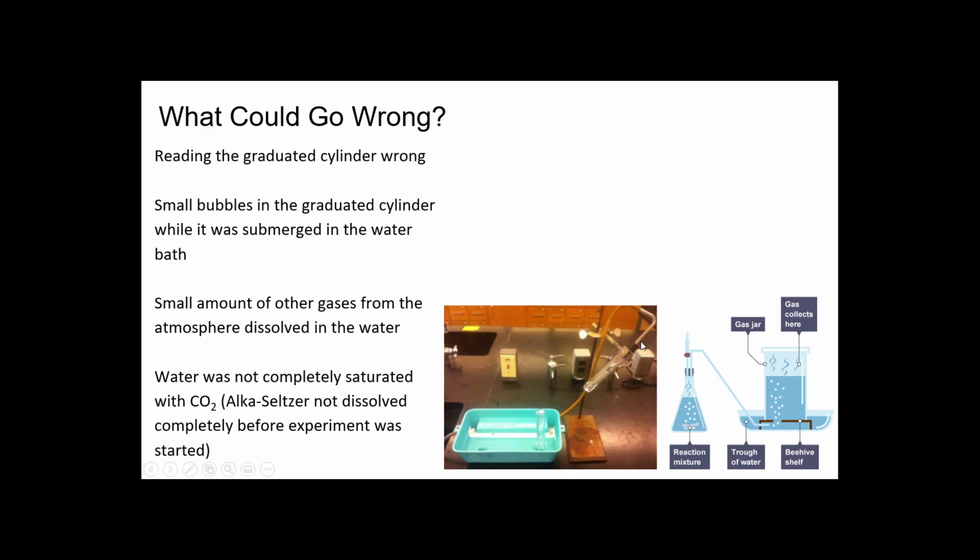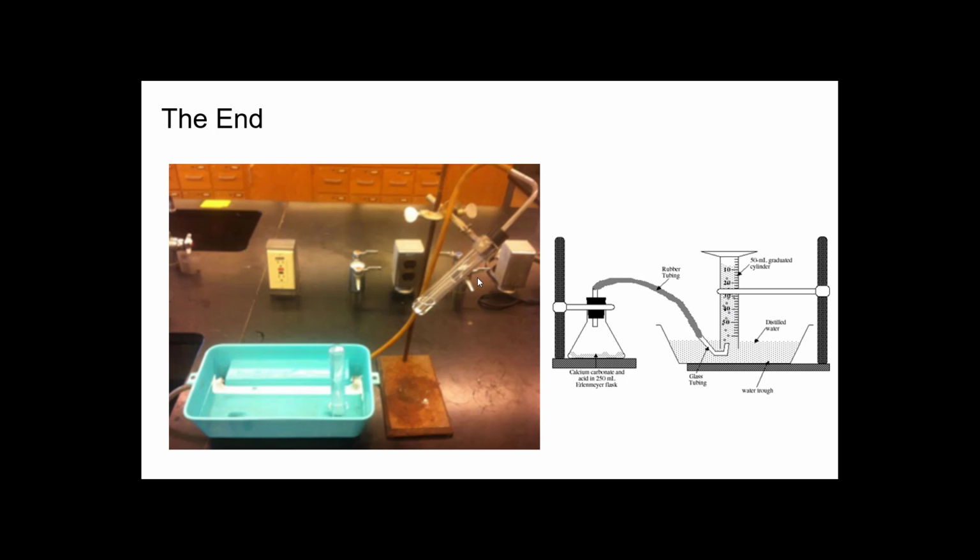Besides, I had a student that lost the stopper in the middle of this reaction and HCl went all over and they had to clean everything and start over. That's the fun parts of chemistry. And that's it. The lab is over. So hopefully you understood this and this helps you finish this lab.